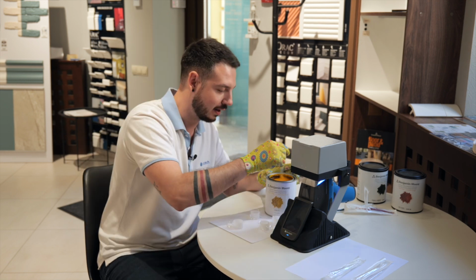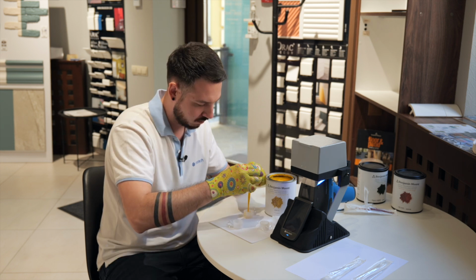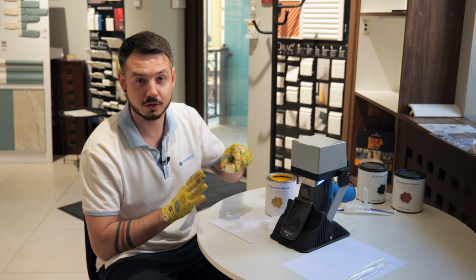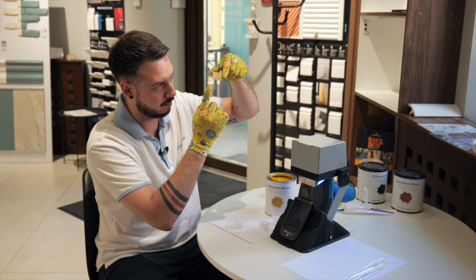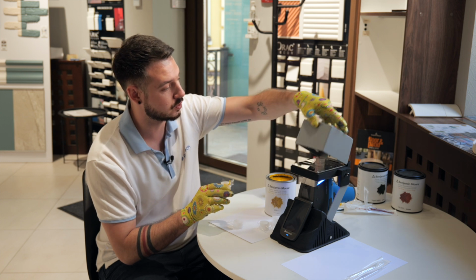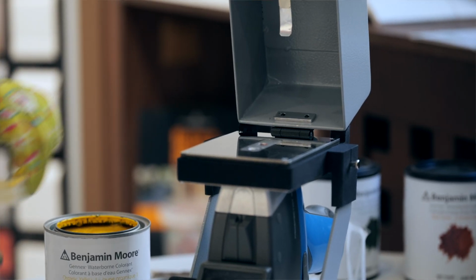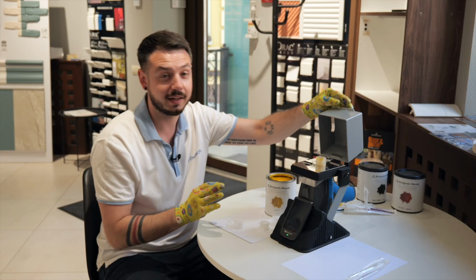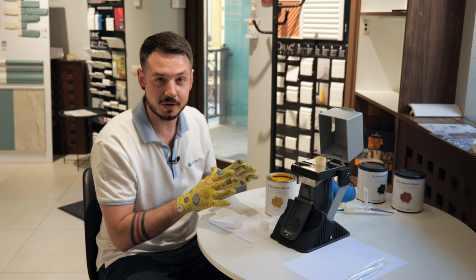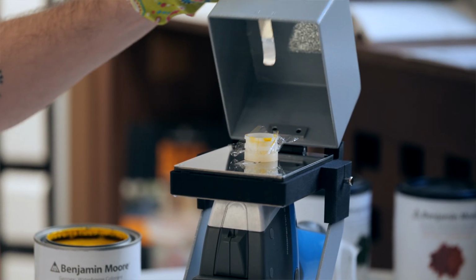Checking the sample cup. And again, we just shake and mix a bit. And again, this amount of liquid is absolutely alright because it's covering all the measurement area of the sample. And we just need to switch between two samples and can perform an analysis. And again, as I expect, this color will have the lowest contamination of lead, but it's just my bet. Let's see how it works.